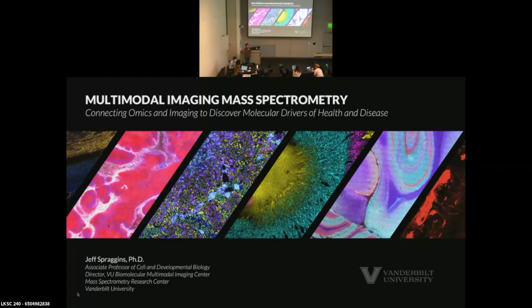IMC or MIBI is that the mass spec is done so that you're analyzing directly sort of endogenous native chemical species from the tissue. So it doesn't require the use of labels or anything like that. And so it opens up a whole world of really complex biomolecules that you can analyze directly that really aren't tractable to look at with targeted approaches, like glycans and lipids and stuff in ECM and everything.